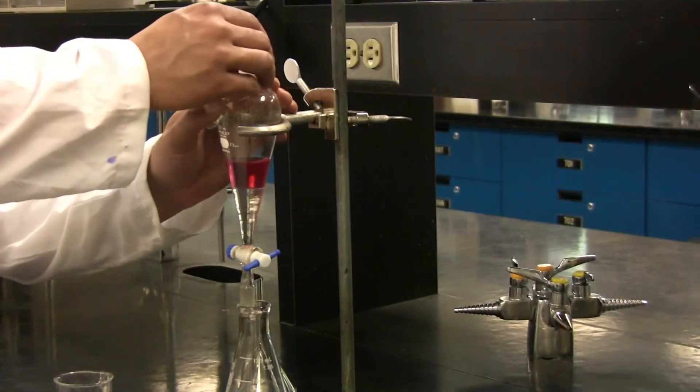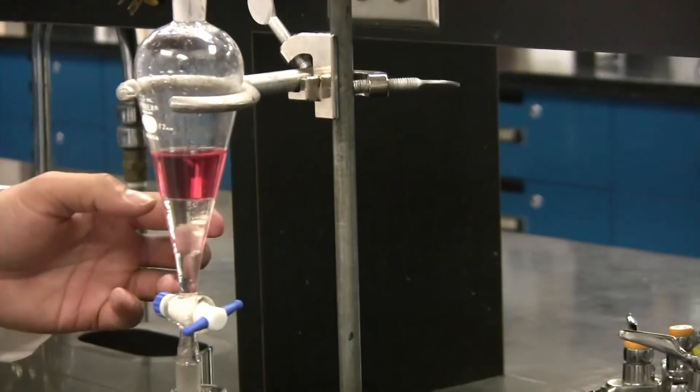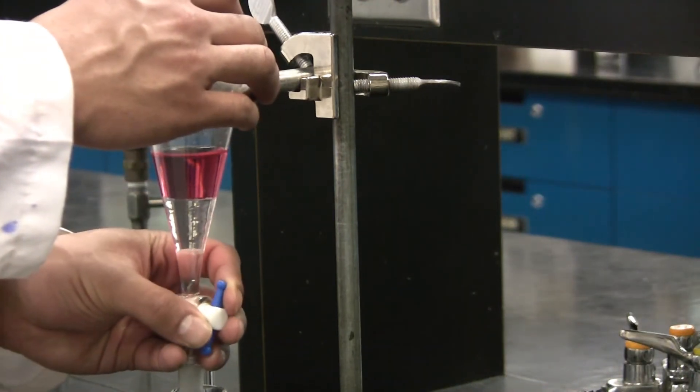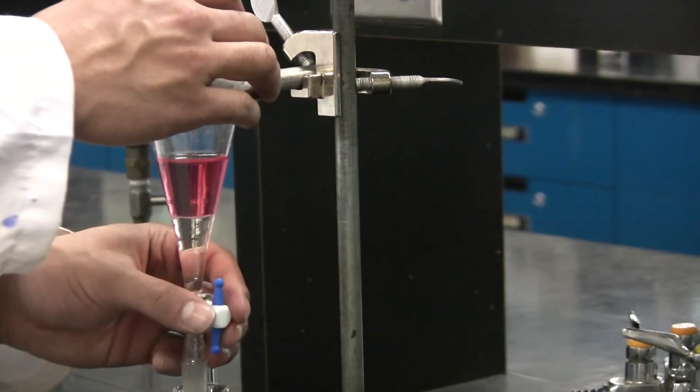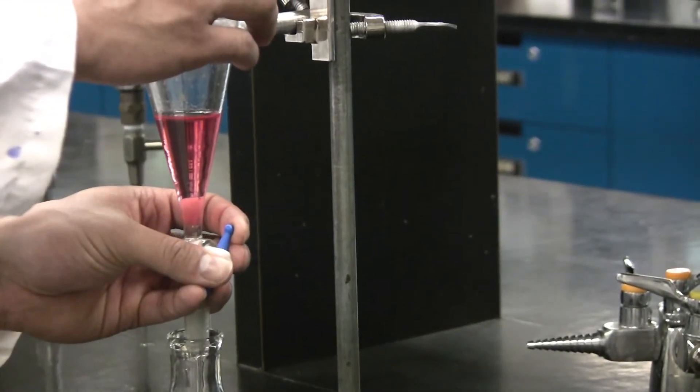When the separatory funnel is back on the ring clamp, remove the glass stopper to make sure there is no vacuum when draining one of the solutions into an Erlenmeyer flask. Make sure none of the second layer ends up in the Erlenmeyer flask. Be very careful with this part.